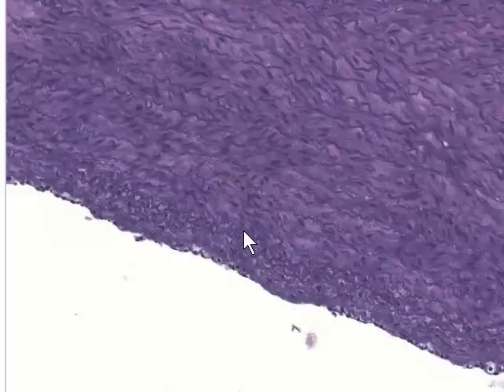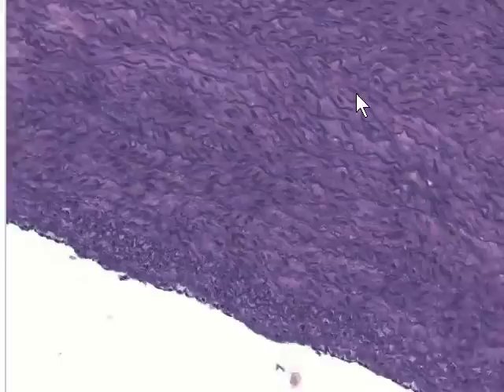But broadly we could say that the tunica intima extends from the pointer to about here. And it's here where we start to see the first of these elastic lamellae increasing in number as we progress through into the tunica media proper, which is extending from here to, say, here. And here we see the very large elastic lamellae. We see very little detail between the elastic lamellae other than some reasonably homogeneous pink staining, which really represents collagen fibers and smooth muscle cells. And we can in fact see stained the nuclei of smooth muscle cells here.